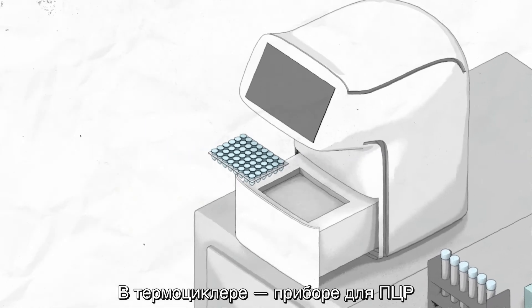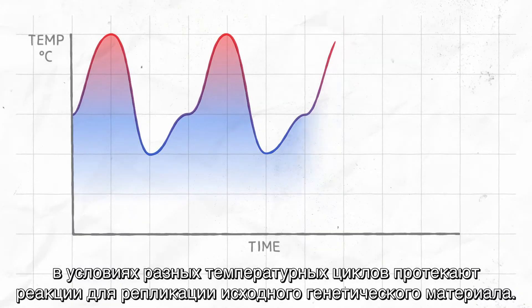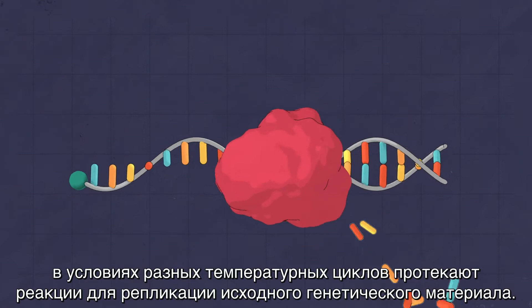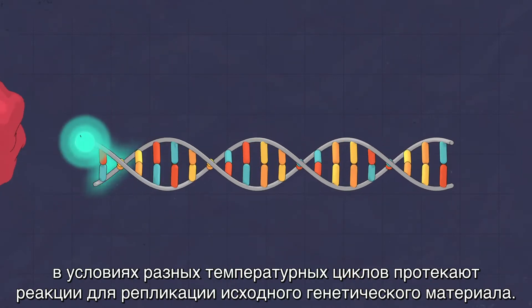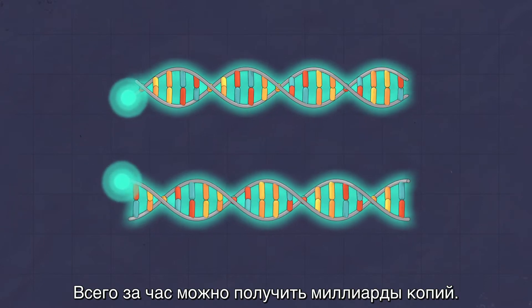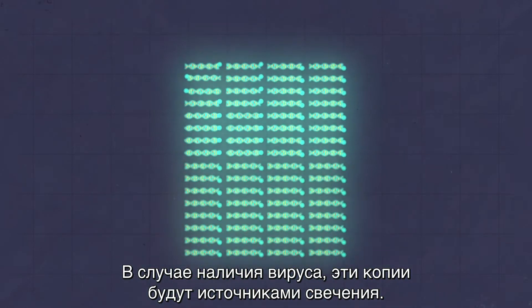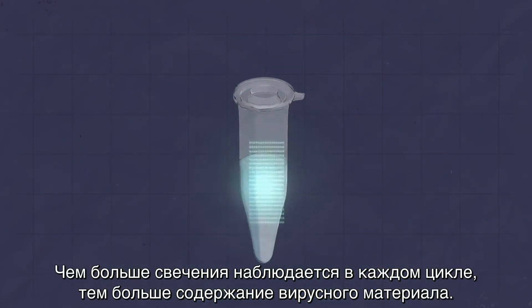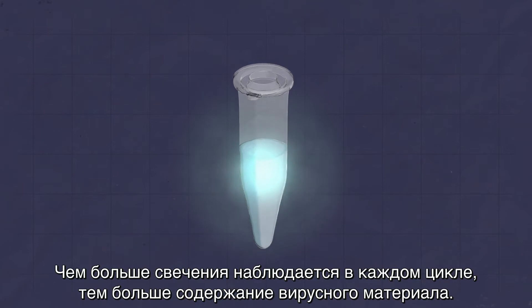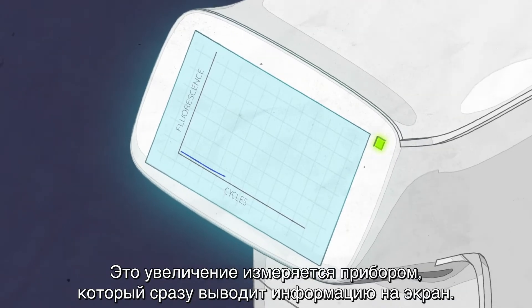In a PCR thermocycler machine, different temperature cycles trigger chemical reactions that replicate the original genetic material. In about an hour, billions of copies are made. If the virus is present, the copies will generate fluorescence. The more fluorescence in each cycle, the more viral material is present. The machine measures this increase and displays the information immediately.